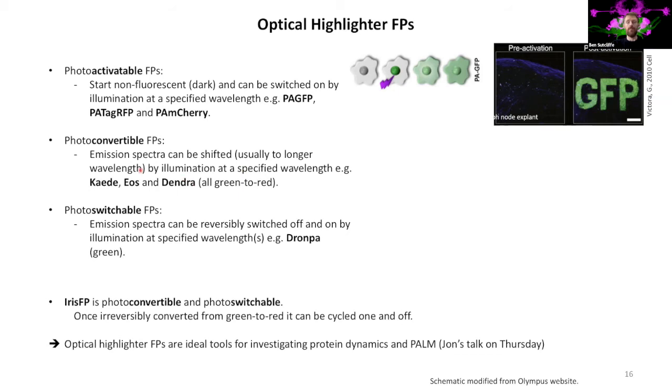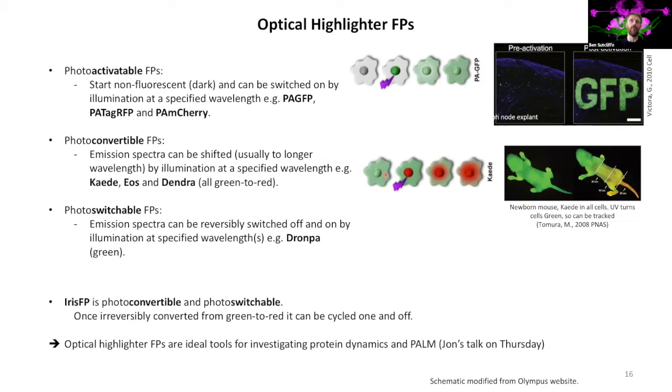Next, we've got photoconvertible fluorescent proteins, and these are ones that you can shift the emission spectra from green to red.